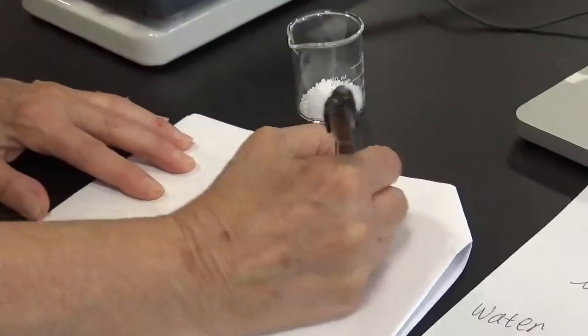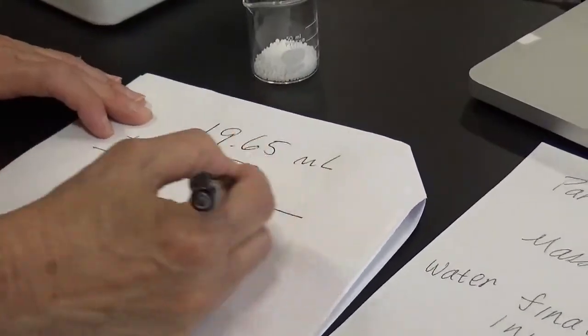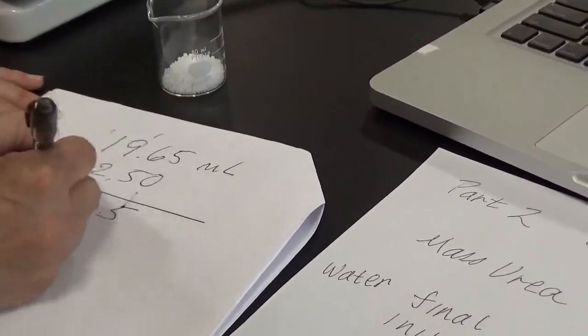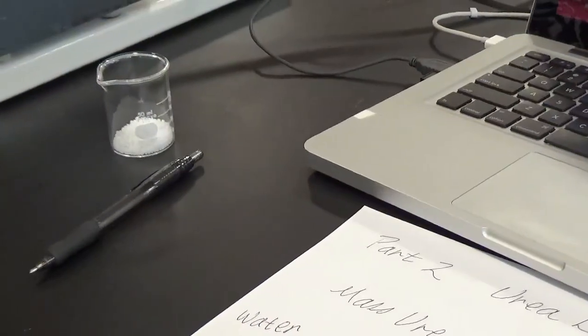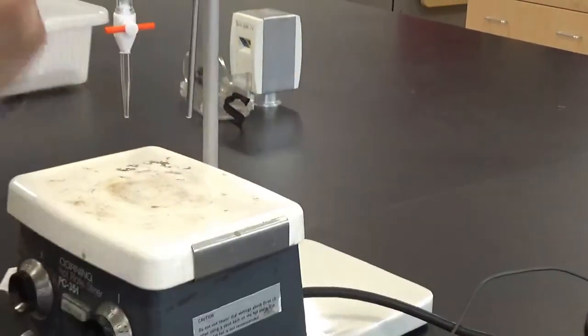So if I had 19.65, and I add 2, say 2.5 is about half the number of grams, which was about 5, 22.15. So I'm going to let the water flow in here until I get to 22.15.